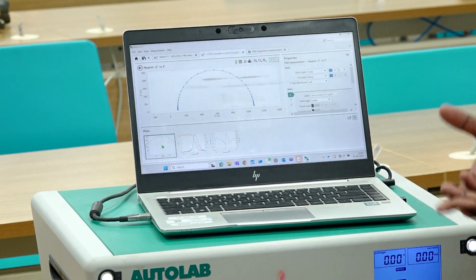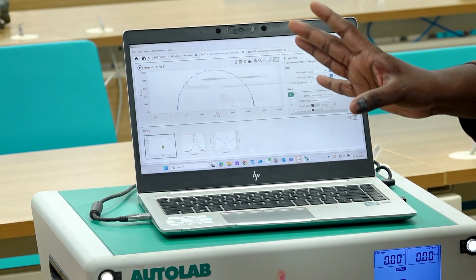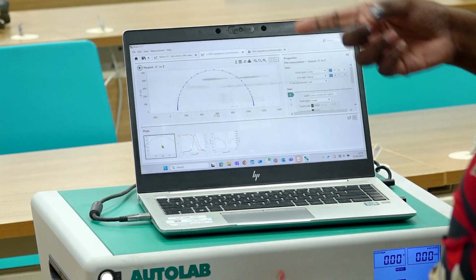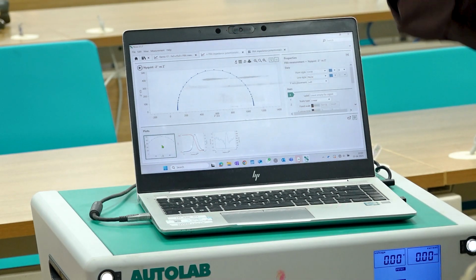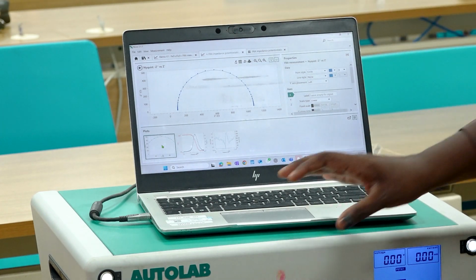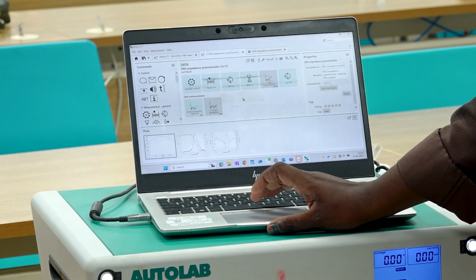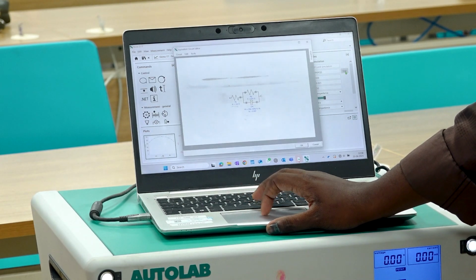It's not that every fitting is correct, so we have to check. First of all, it should properly overlap. Our theoretical, raw, and fitted data have to properly overlap. If it overlaps properly, this is correct. Then in fit and simulation, now you can see the values.